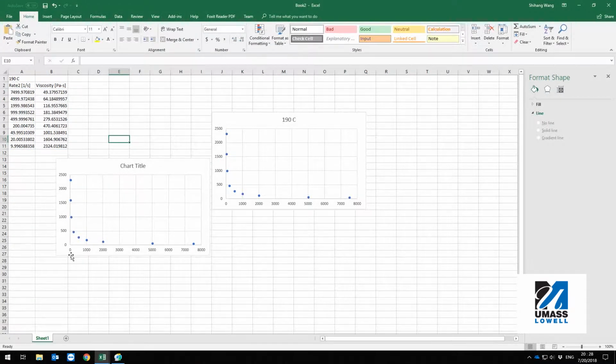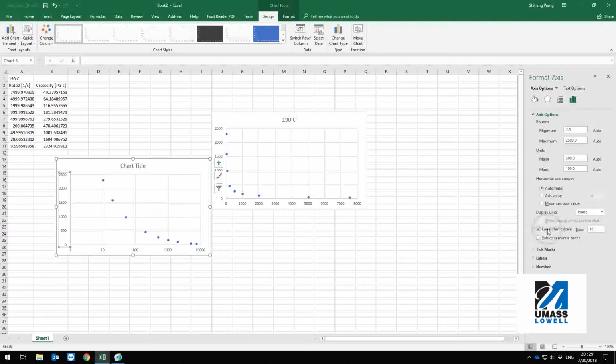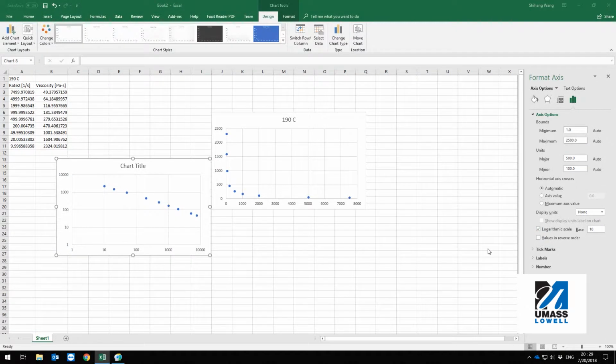So to scale our graphs, which is necessary for viscosity data, we are going to double-click on the axis scale, which opens the formatting tool of this axis. In this case, we want to plot our data in a logarithmic scale. We select this for our first axis, and then by selecting the y-axis, the window will change, and we can select here also the logarithmic scale value.